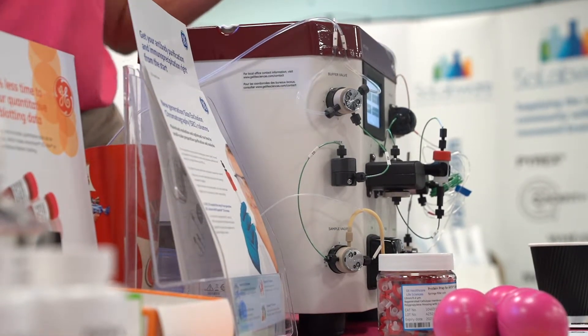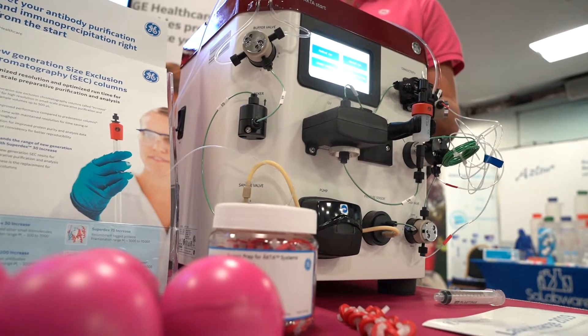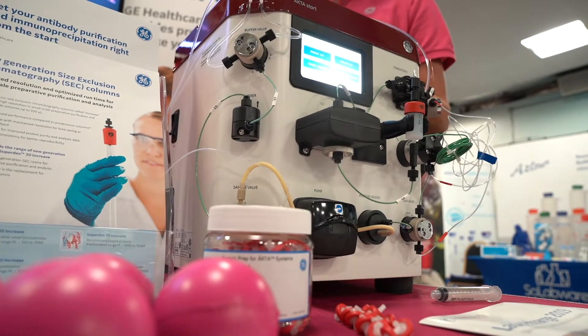Hello, my name is Ruth Westwood and I'm a sales specialist for GE Life Science. Today I'd like to introduce you to our Acta Start. This is an affordable, simple-to-use system designed to make your protein purification as simple as possible.